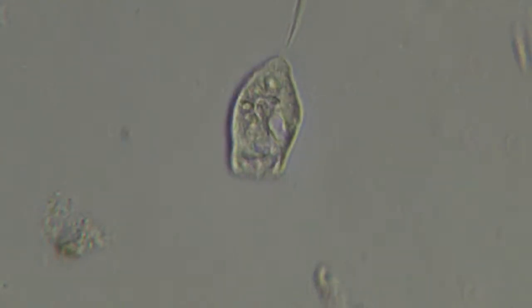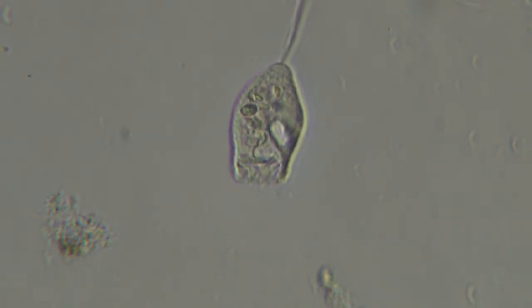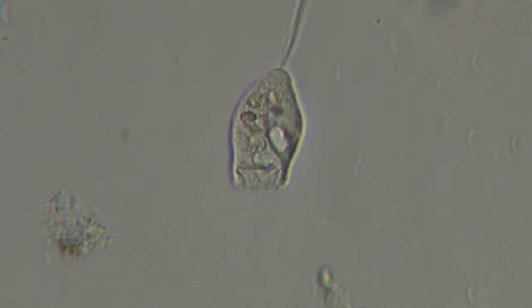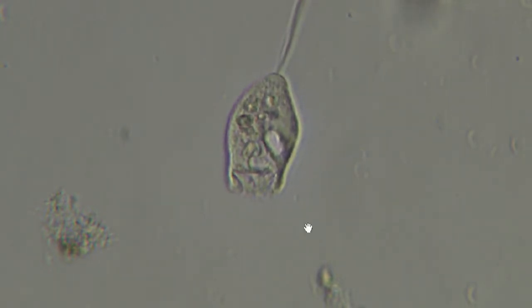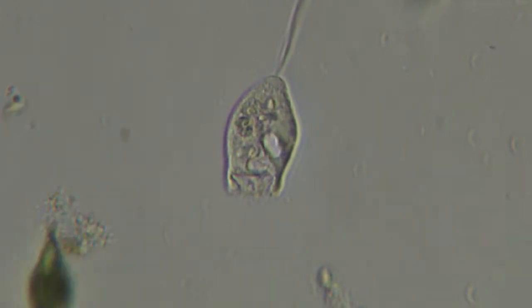So yeah, love me some Vorticella. I have a video from maybe a year ago. There's one in particular just pumping away with the cilia, and it's creating a, I'll simulate it with the hand here, it's creating this little vortex going whoosh, whoosh, whoosh, whoosh, and stuff is bouncing off of it because it's too big. And it's creating this little vortex around it. It's hilarious.